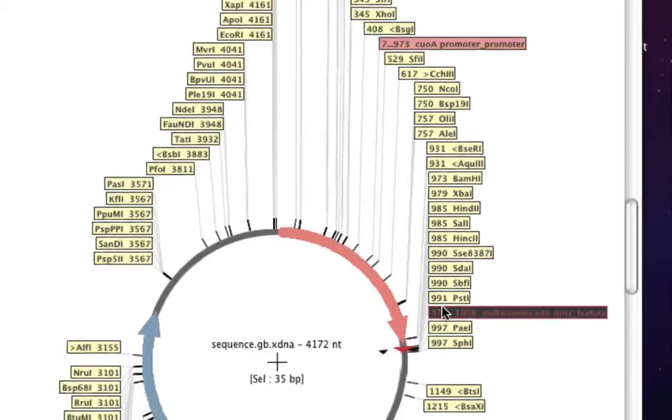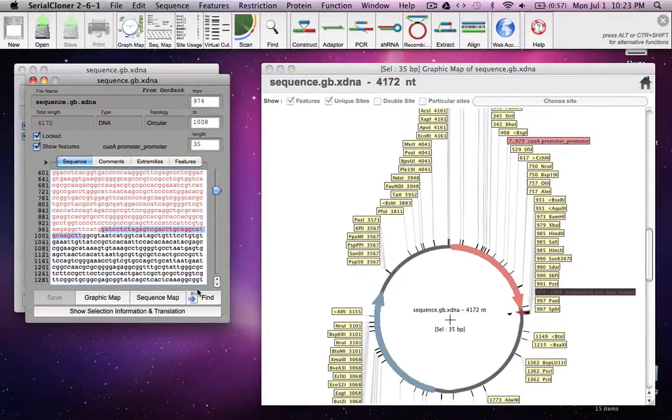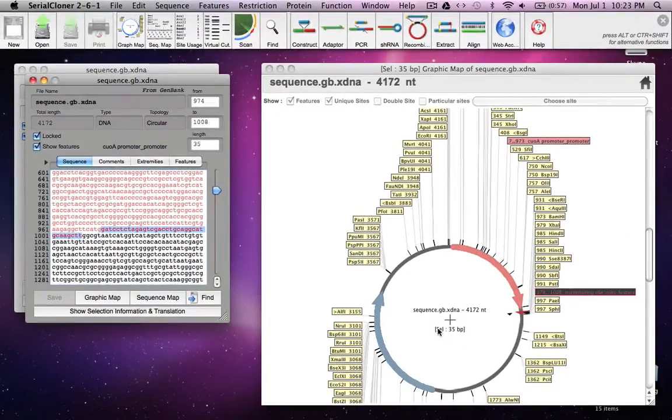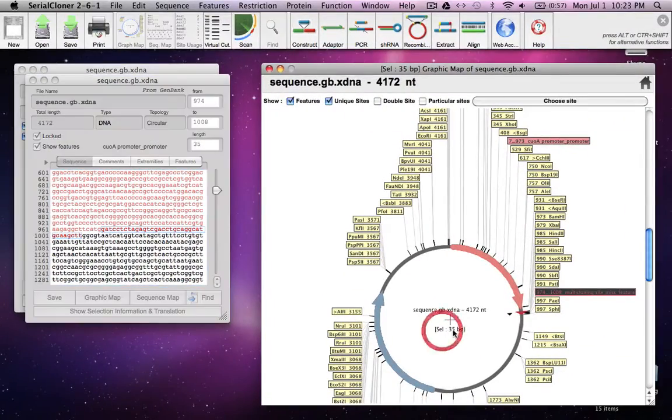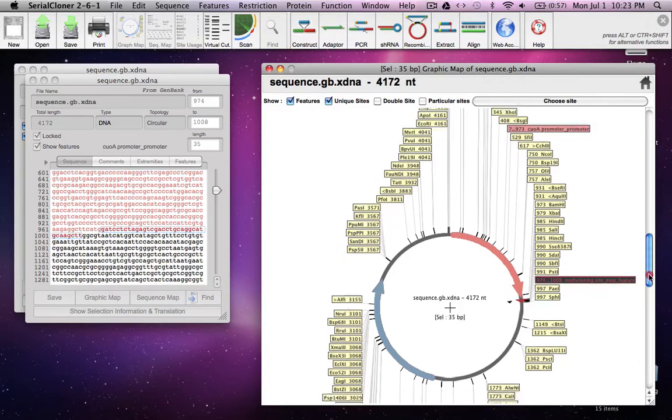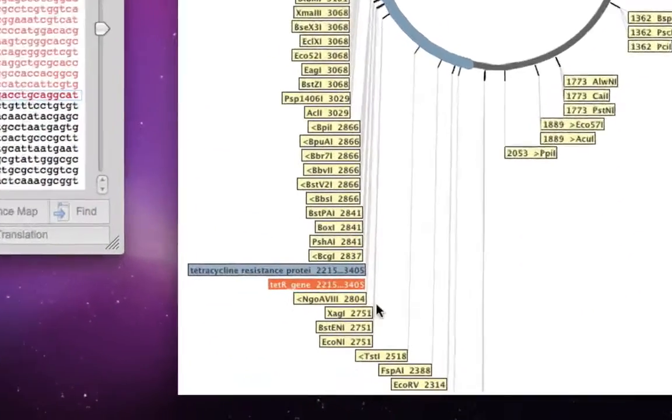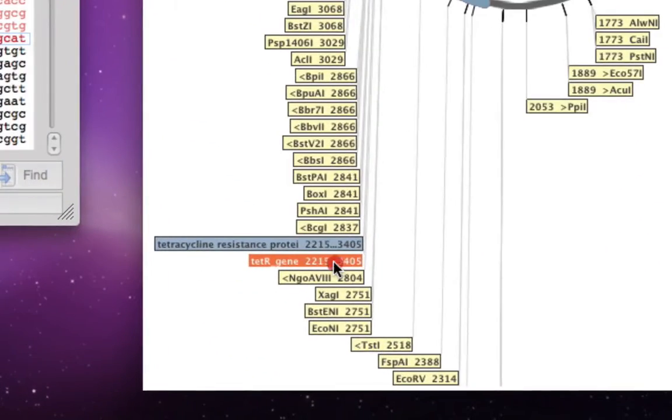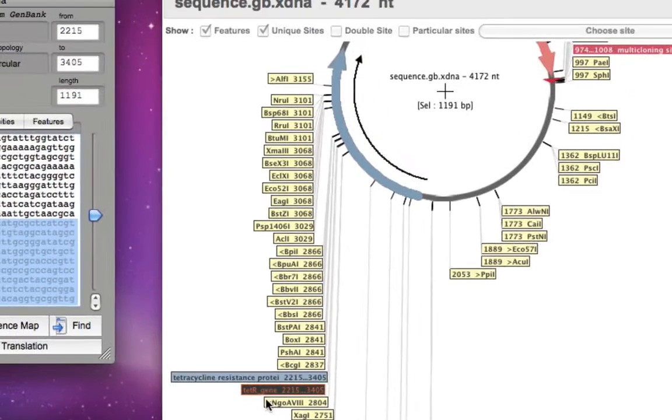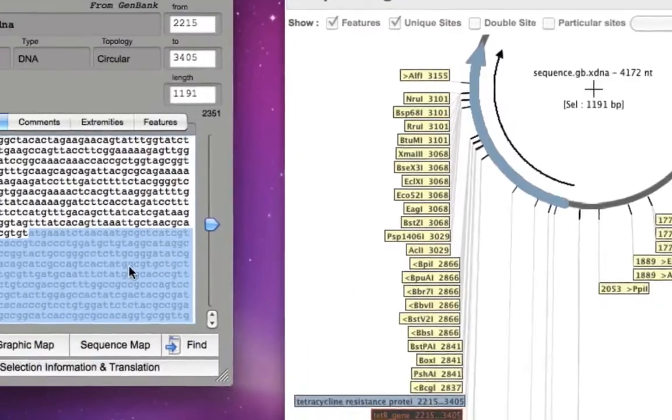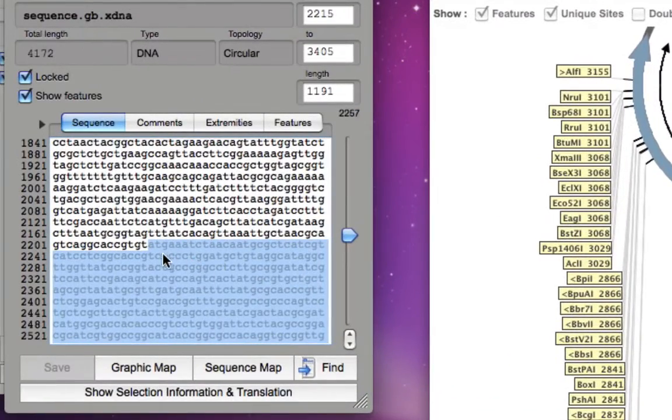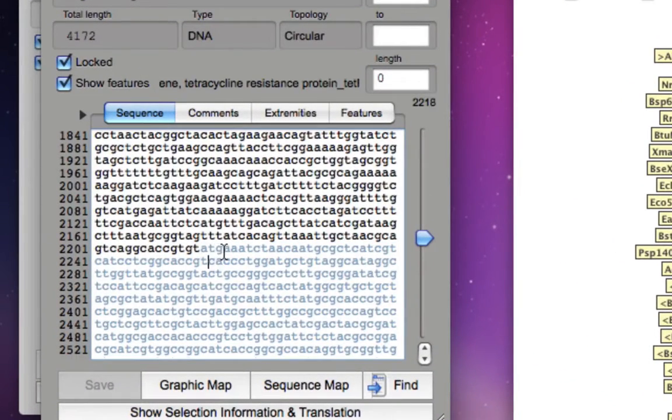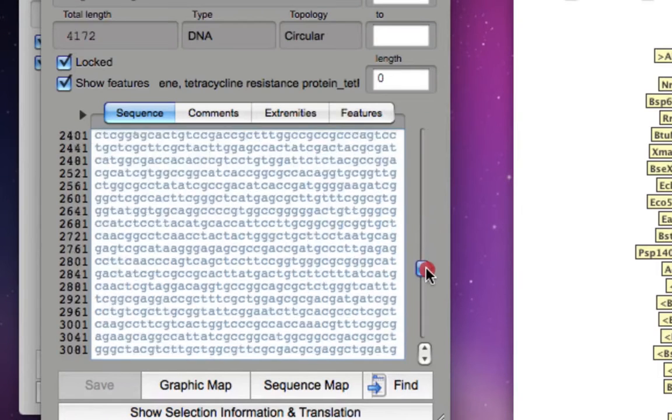In the text pane you can see the highlighted sequence. Similarly it also has a tetracycline resistance gene, here it is. If you click on it, it will highlight the gene in the graphic map as well as in the text pane. It starts with ATG which is the start codon.